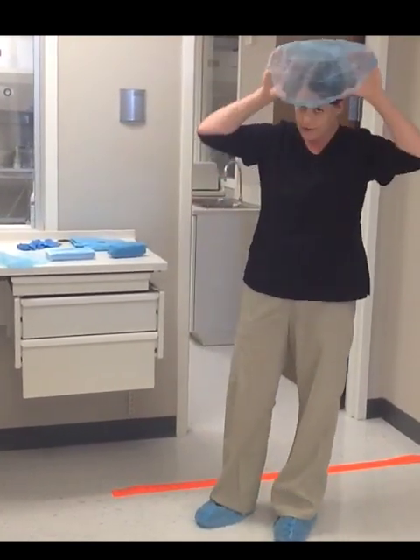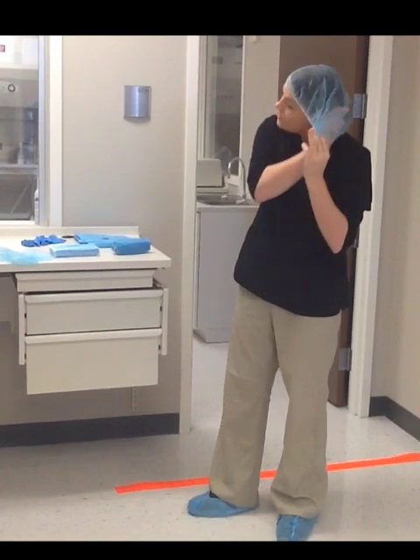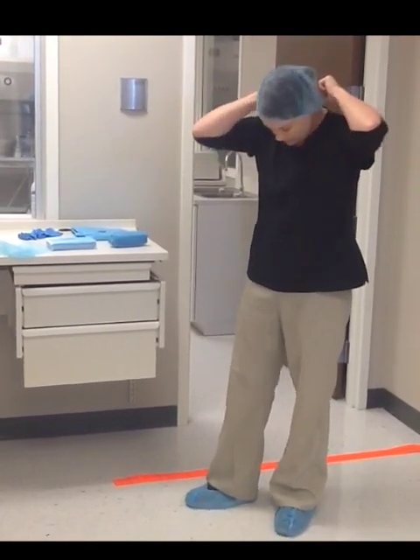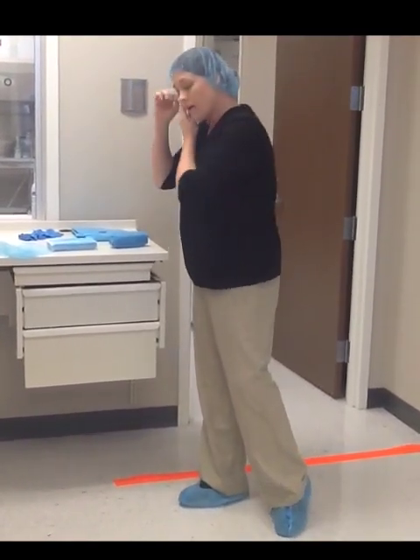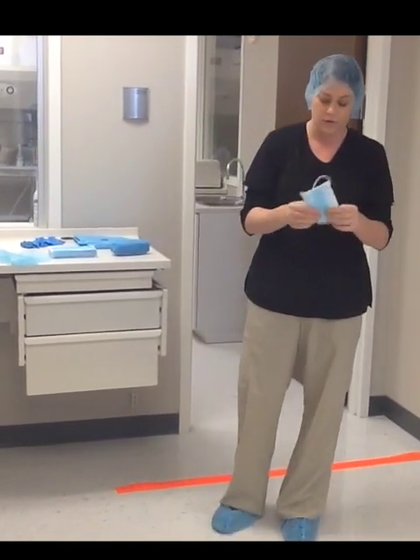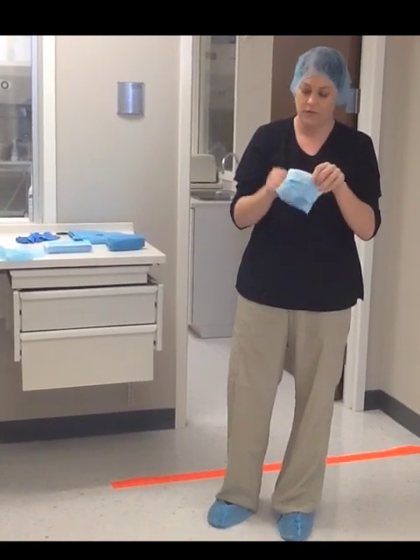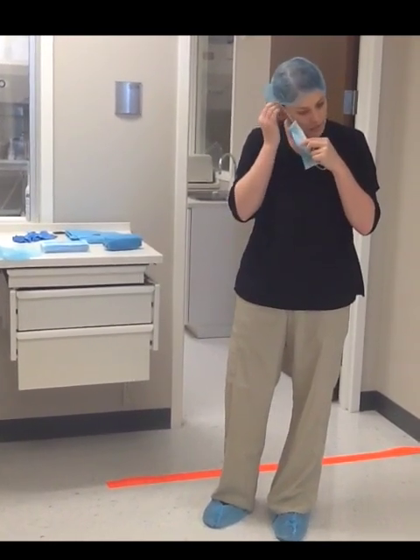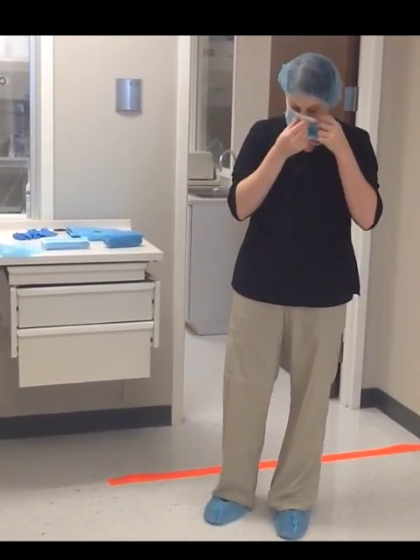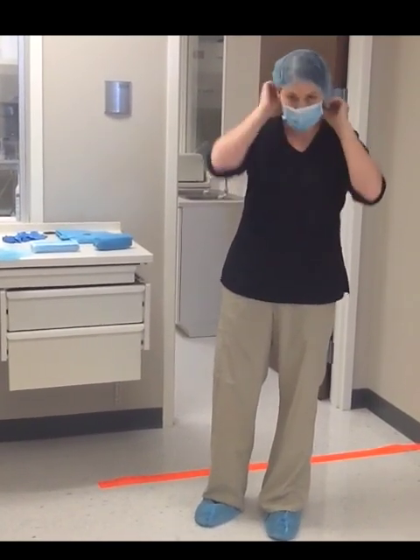I want to make sure all my hair is covered. And gentlemen, if you do have a beard, they do make beard masks for you, or we can just use a regular face mask. After this point, I am ready to wash my hands.